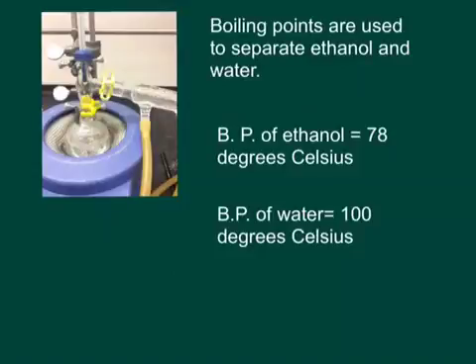In order for this distillation to work, the compounds have to have different boiling points, and one of the compounds must be more volatile than the other. If one of them wasn't as volatile, or if they were just as volatile, they wouldn't be able to be separated because they would both be evaporating at about the same time if they also had the same boiling points. These differences are what allow the ethanol and the water to be separated and allow this distillation to work.